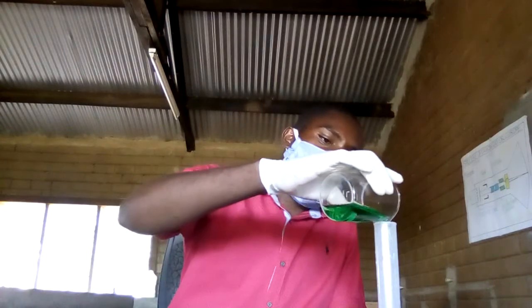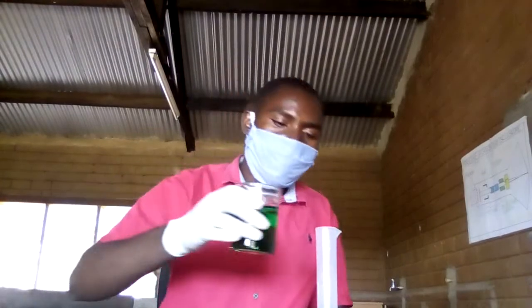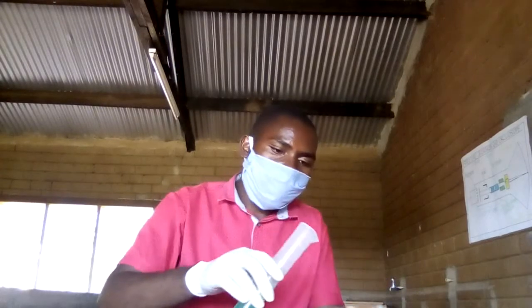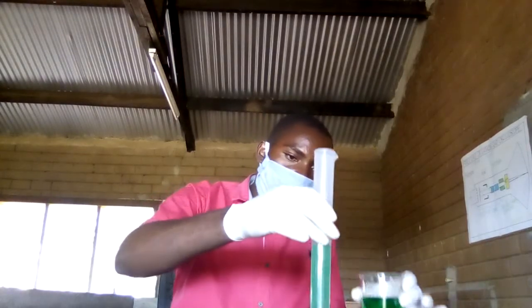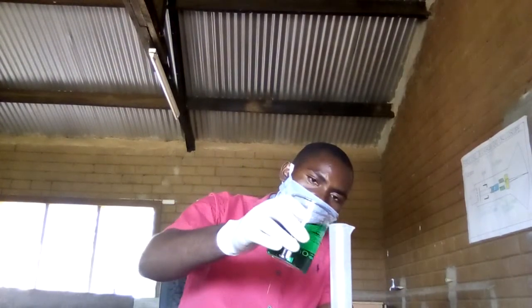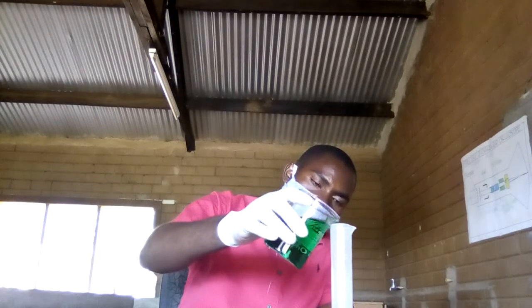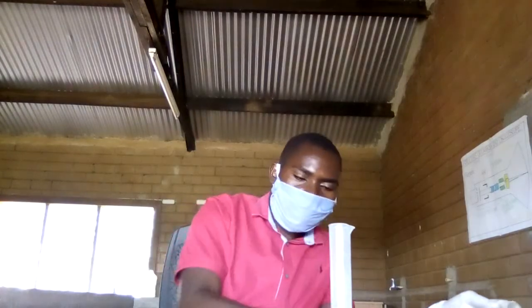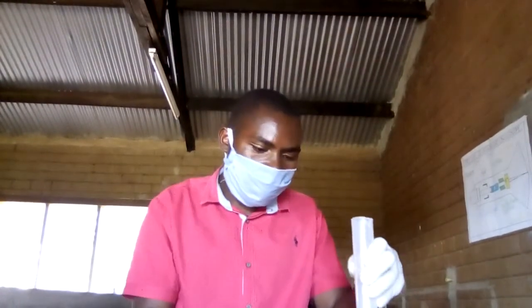This is what I've done. Then you're going to measure about 50 cubic centimeters. So too much. So I need to pour it back and see also some drops. Okay, it's done. So make sure that the area where we're working from should be kept clean. You need to have a mop or cloth always, so that the area does not get messy.